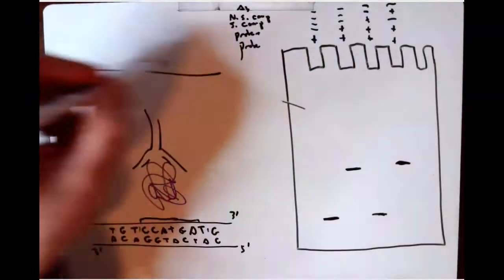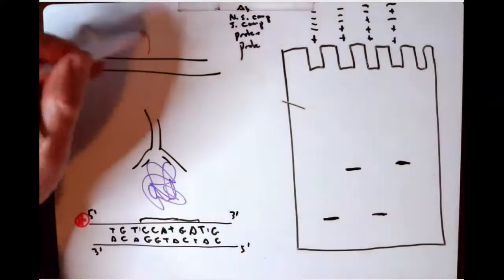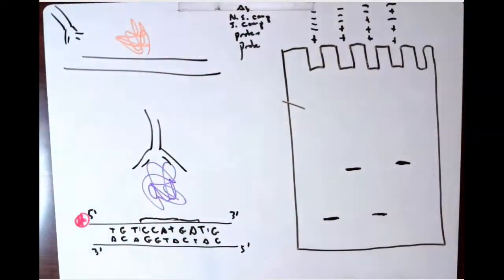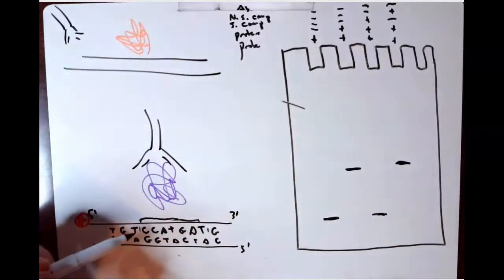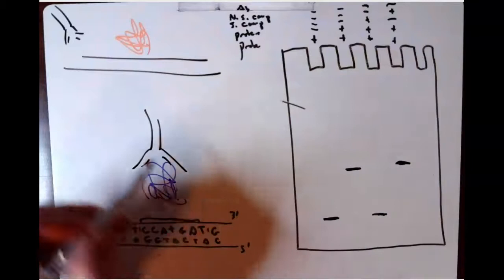And if the other alternative were true, and it was some contaminating protein that was binding there, of course our antibody would not bind because our antibody is specific to the protein we're studying. If the antibody binds, we have an even larger molecular weight structure than we had before. In other words, we now have the probe, our protein, and the antibody.